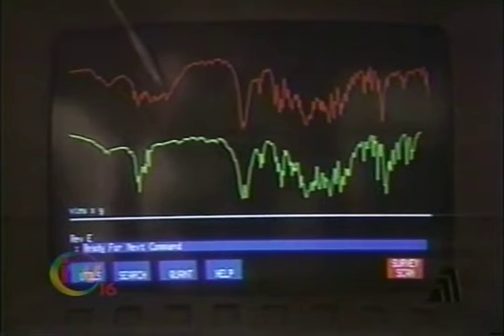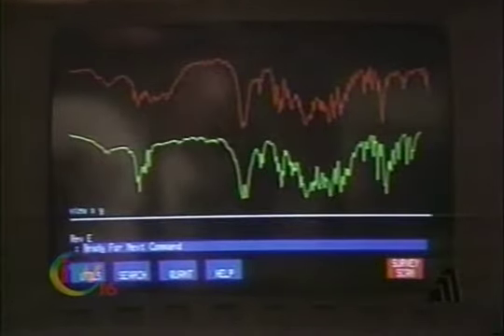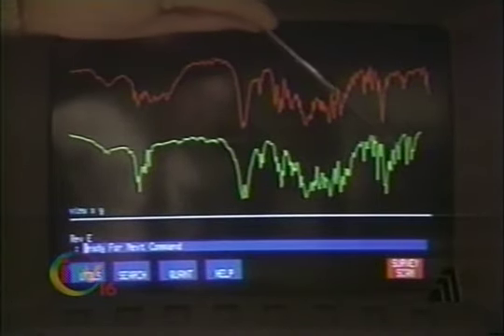Okay, now here you can see this is the hydrochloride. Now you can see the hydrochloride area right over here, which is absent in the cocaine free base. And the rest of the molecule, more or less, is similar.